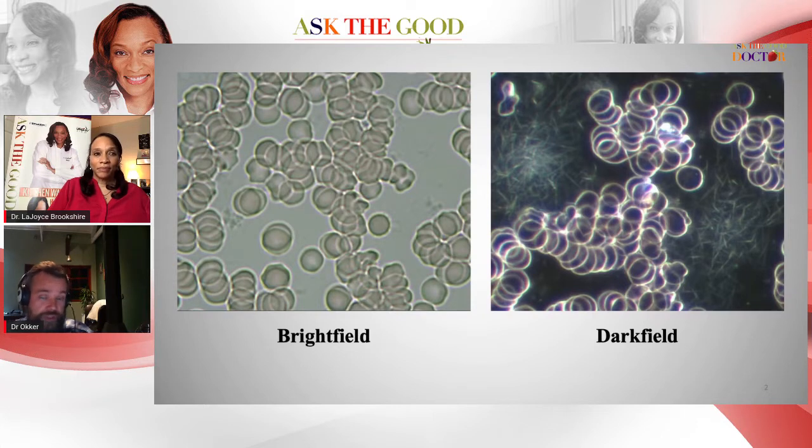With these cases, if there's rouleau in a sample, clients are usually aware of some digestive issue. It might be diet related. In some cases, it's simply the digestion and things like probiotics. But generally, when we see this, people immediately say, "Oh yeah, I do have issues with digestion."